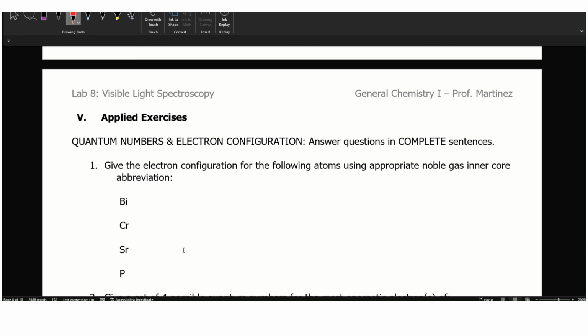I know it's a lot of work, and I know this lab is a little bit more complicated, but I think it's a very good lab. You're recording your own measurements, and you're taking your own measurements, and it's a good technique to understand.